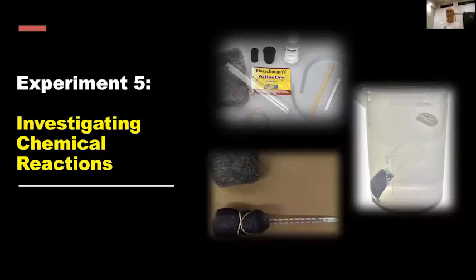And it looks like you've done a pretty good job with the pre-lab quiz, because you've already sort of recognized what single replacement, double replacement, that sort of thing are. And we've talked a little bit about them in class. And tonight we're going to see them, with a little hands-on demonstration.